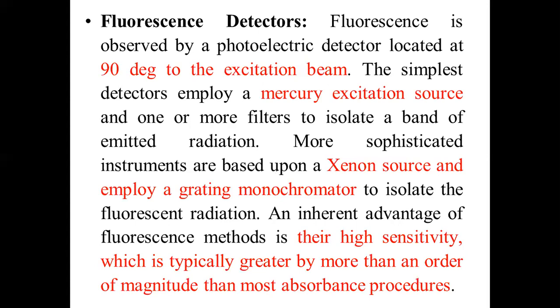I have already stated the definition of fluorescence. If a molecule is fluorescent in nature, assume you have a solute. In order to measure the fluorescent intensity, that molecule should be fluorescent in nature. This fluorescence is due to the structural property, the steric hindrance, the pH of the solution, the conjugation, dipolar interaction, whatever it is, structural rigidity. All these things play a role while measuring the fluorescent intensity.